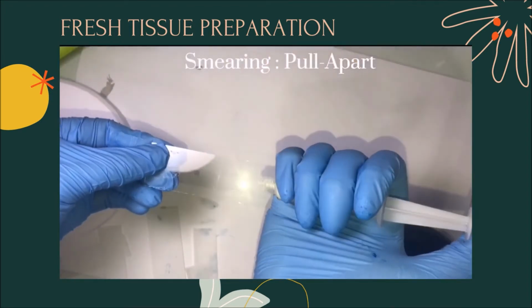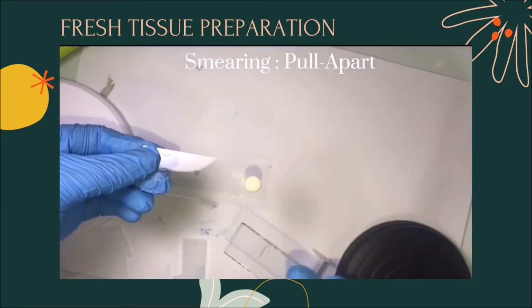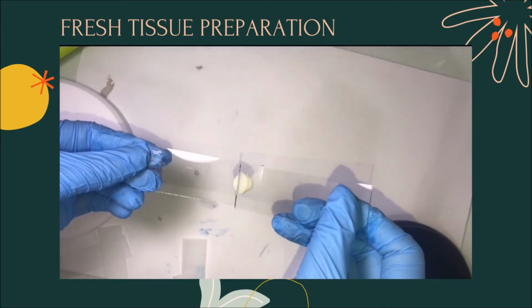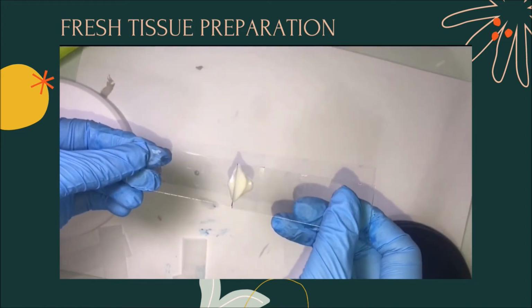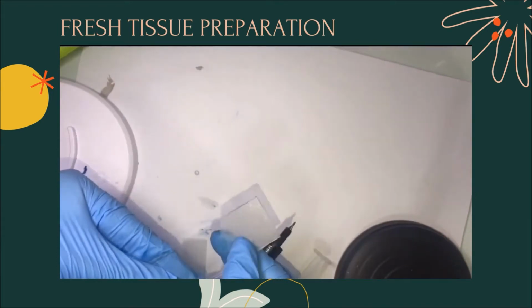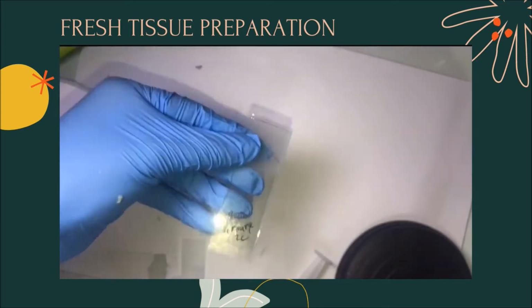For the pull-apart method, place a drop of sediments on one end of a glass slide and cover it with another glass slide. Allow the sediments to spread evenly between the attached surfaces of the two slides. With a single uninterrupted motion, pull the two slides apart in opposite directions and cover with a cover slip. Then, label.